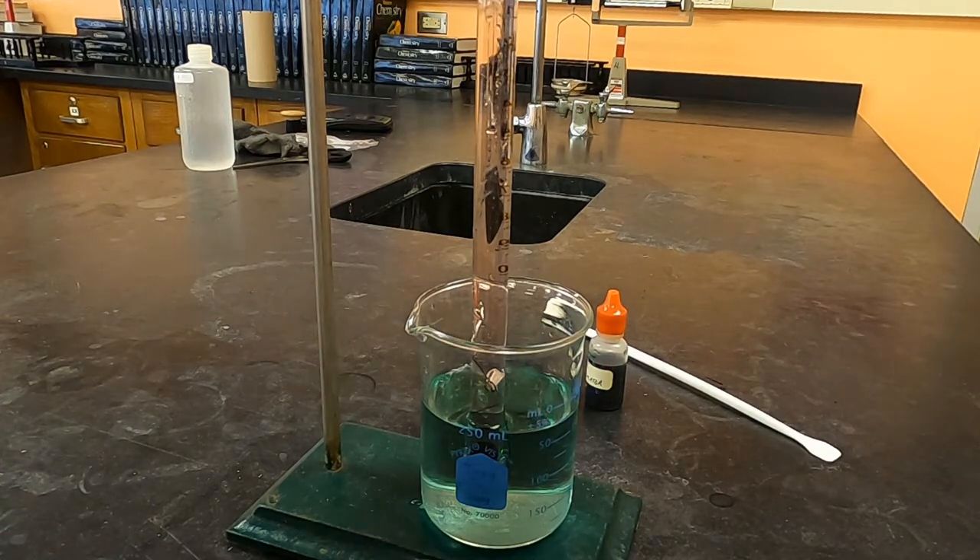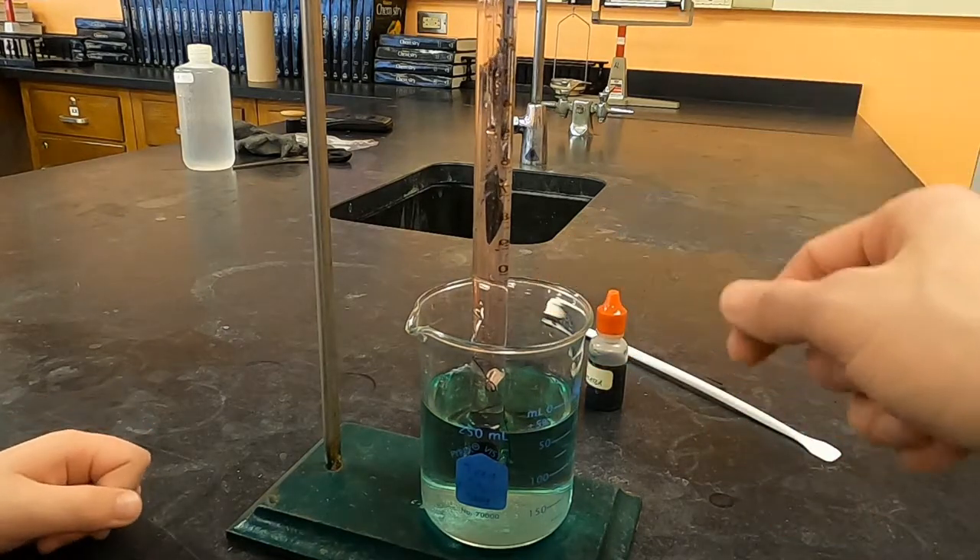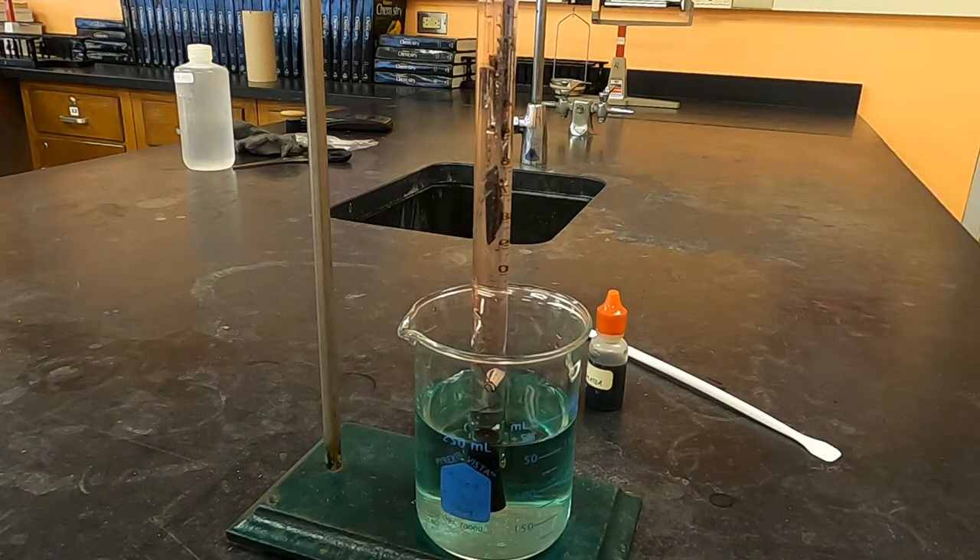So you can see how it's changing color. And now look at the bubbles on the piece of metal. It's going to go past once the acid gets down there.